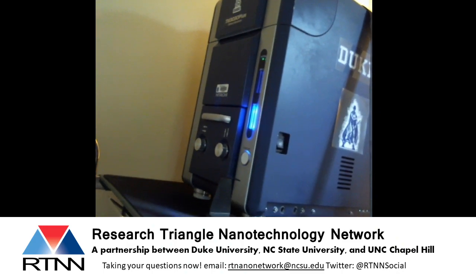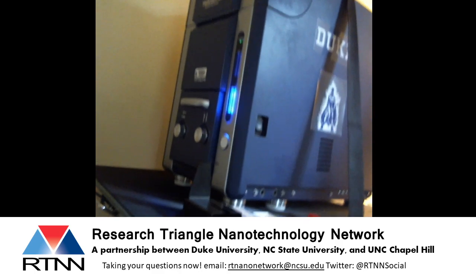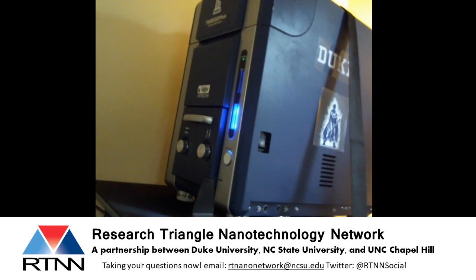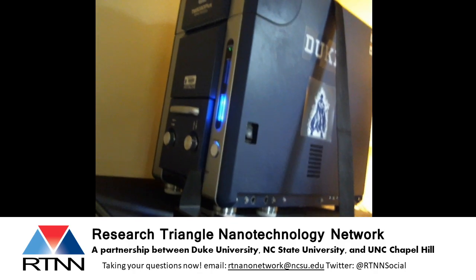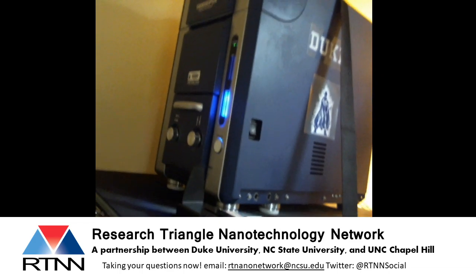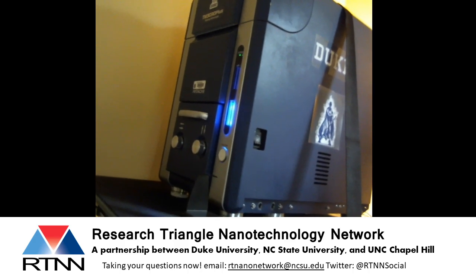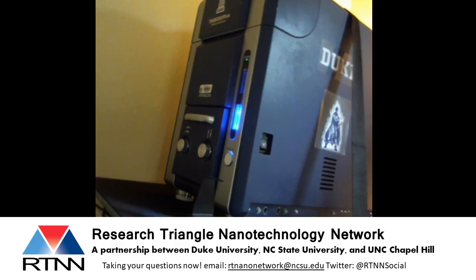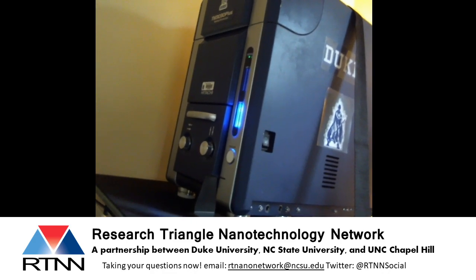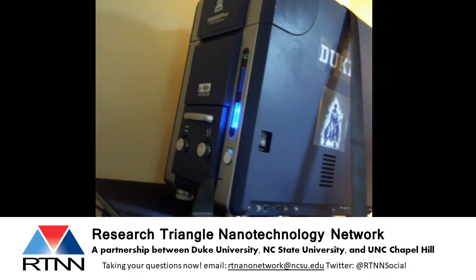The other thing you'll notice about this electron microscope is that it's kind of just a big box. And it has to be a big box because in an electron microscope, the sample that you look at and the electrons have to be inside of a vacuum. What does that mean? Not a vacuum cleaner. It means that we've pumped almost all of the air out of the chamber inside of here where our sample is sitting. Why would we do that? Because electrons are so tiny that if they hit the air molecules that are normally in air, they would bounce the electrons out of the way and they wouldn't make it to our sample to make a picture.